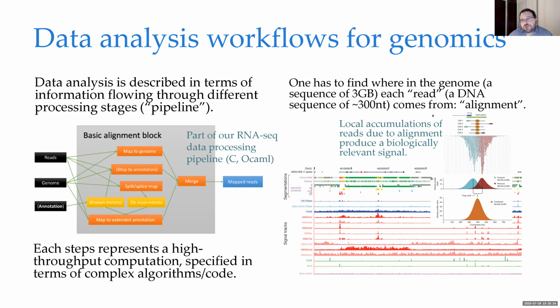The reference human genome is very large, a string of about 3 gigs of ACGT letters. Sequencing machines cannot really decode the genome as a single chunk, but return small chunks of about 300 letters each. One of the steps, called alignment, is to locate the small string in the original reference, so as to understand where this small chunk comes from in the big original genome.